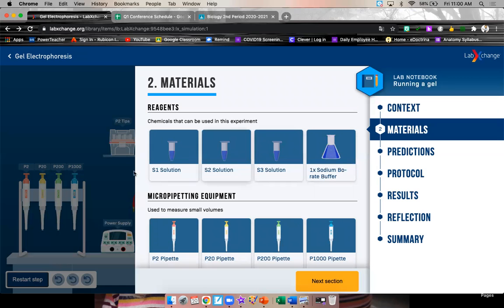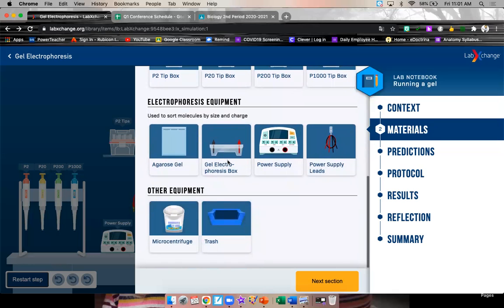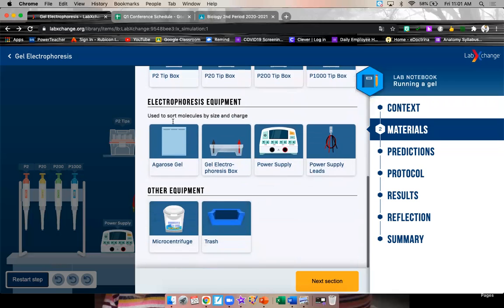So your materials. Solution one, two, and three are three samples of DNA. The sodium borate buffer is the liquid that this all stuff is going to be working in. This is basically salt water. Salt water helps electricity move better. Then we got some pipettes and pipette tips. So they're like really fancy eye drops. We have our agarose gel that we're going to study the DNA in. We're going to put the agarose gel in the electrophoresis box. This is what we are going to run electricity through. We have a power supply and some wires, and we have this thing called a centrifuge. We're actually going to spin our samples to get the DNA to settle down in the bottom. And then a trash can.